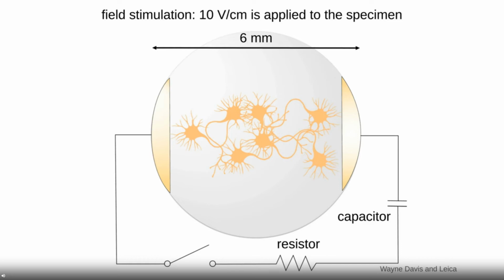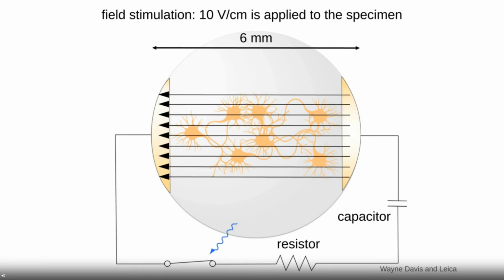So here's the basic setup of what we term zap and freeze, and the principle by which it works. Essentially, you just have a capacitor that's charged up and closed by a photoelectric switch. So when this is charged up, the neurons aren't being stimulated. You charge it up, everything goes into the high pressure freezer, and then once in there, everything works just like it does in flash and freeze, except now your light shines onto that photoelectric cell, that closes the circuit, and then you just shine the light for a millisecond, boom, those cells get zapped for a millisecond.